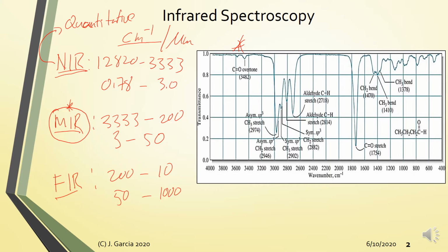You feed that along with the NIR reading from the instrument, and then a chemometric algorithm will formulate an equation or model so that when you analyze an unknown chocolate sample, you will instantly get the percentages of protein, carbohydrate, and fats. It's a very advantageous system, although somewhat expensive. So that's one application of NIR.